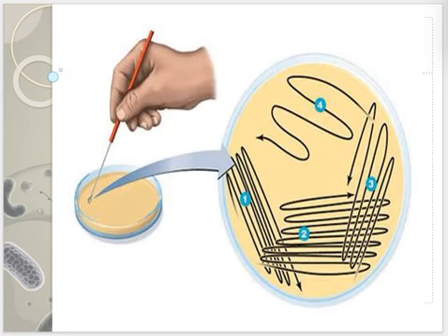To explain streak culture further, you start by streaking the inoculum in one area, then progressively dilute it across the plate in multiple segments. The loop is flamed and cooled between each section to prevent carrying too many bacteria forward. This results in isolated colonies in the final segments, which are essential for pure culture studies and identification.